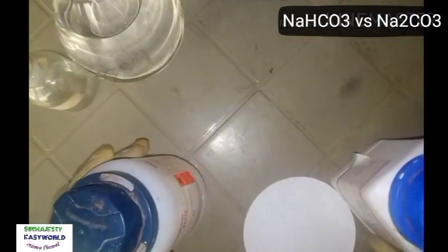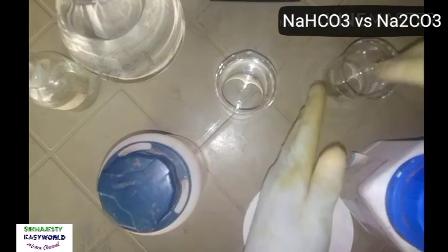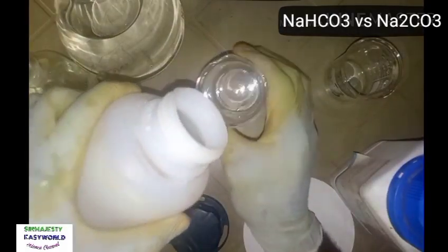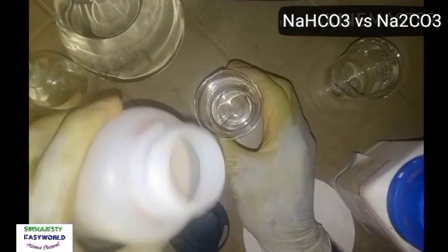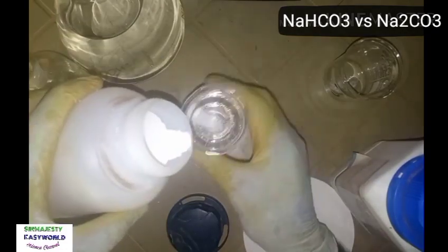Then another way is that over here, I can use these two beakers. Here should be for bicarbonate, here should be for the carbonate. So here I'm going to make a solution. This is the crystal. All of them are white, of course. Most times the carbonate is more crystalline than the hydrogen carbonate. You can call the sodium hydrogen trioxocarbonate(IV) baking soda.